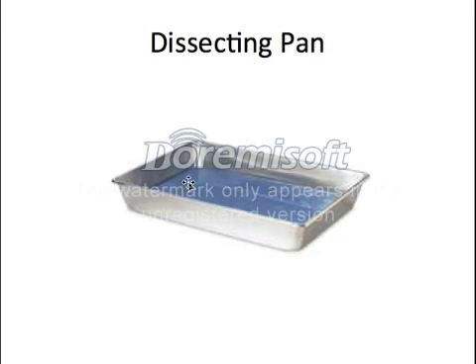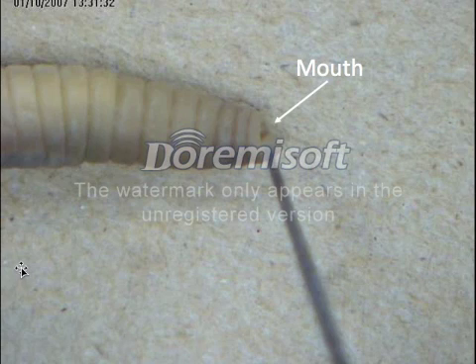A dissecting pan is necessary — your worm should not be out of the pan. It will stretch just about the entire length of the pan. When you get your pan, you will cover it with a paper towel and place all of your dissecting materials and worm inside of it. This is your workspace that you'll work within during the dissections. When you get your worm, the first thing you're going to want to do is lay it in the pan with the light-colored side facing up. You're going to pin right at the front where the mouth is. You'll notice there's an opening on one end — there's actually an opening on both ends — but you're going to pin the mouth. I'll show you how to distinguish those in a minute.